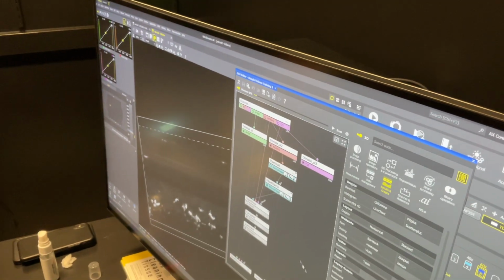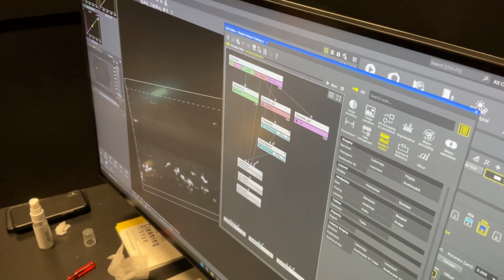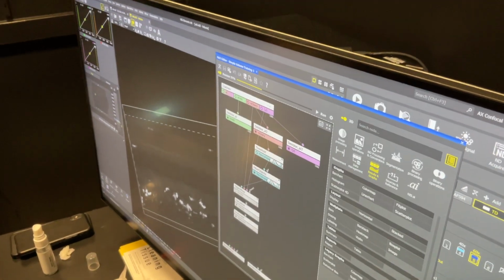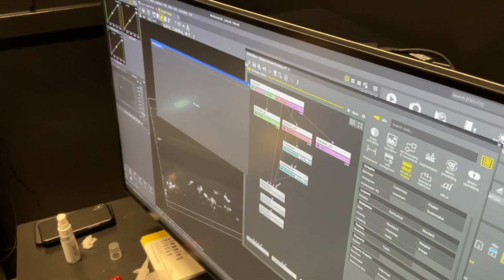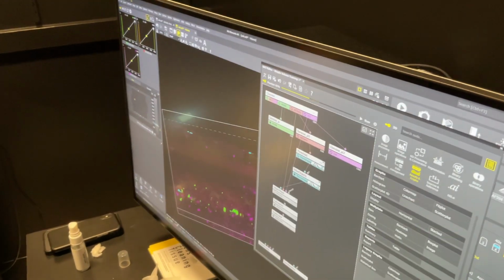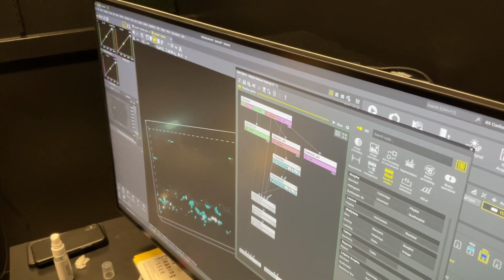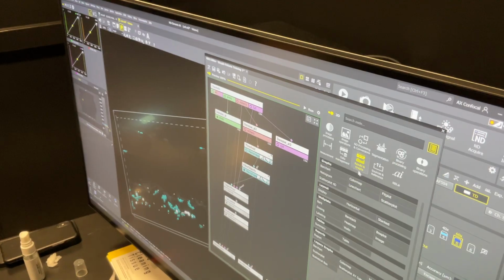So again, let's say we want to make a layer based on the far red, right? Would that indicate infection, or is the green that? Green is that. Okay, hold on, it's building the stuff. All right, so go to our green layer. And we're going to do basically the same thing.